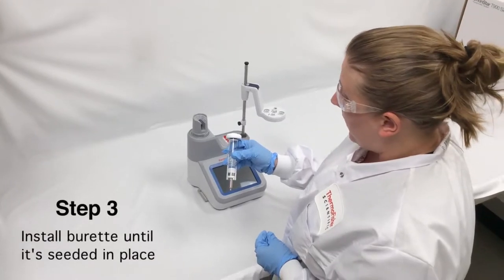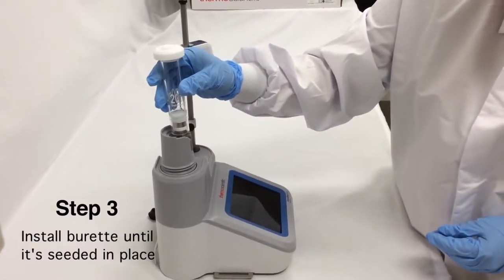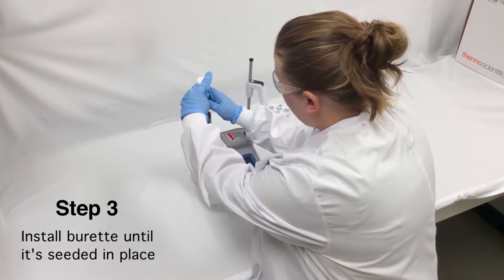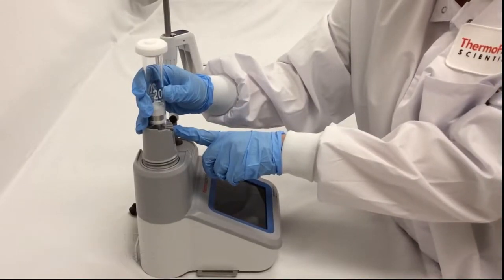My next step, I'm going to install my burette. I'm going to line up the piston ball on the burette with the clasp on the titrator, gently slide it in, and then push down just a little bit on the top of the titrator until the burette is seated in place.